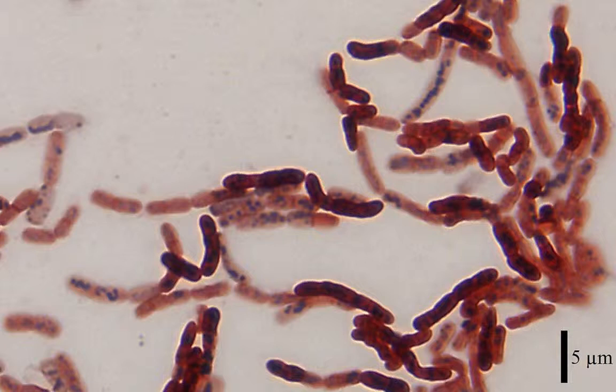And amazingly, if you look closely at this image, you can see some internal features of the cells, meaning that we can get information from this image on a length scale smaller than 1 micron. Maybe even the smallest features on this image that we could identify would be about 500 nanometers. As is clearly evident here, microscopes are a truly incredible tool.